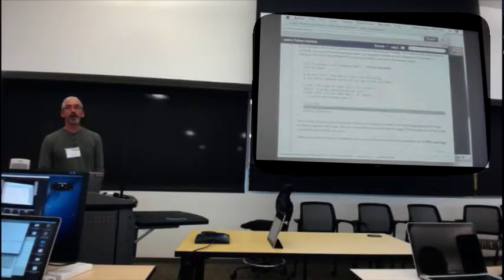Okay, so this is copying the file, and this is the 17-line script. Now it's time for the rubber to hit the road and run Psana.